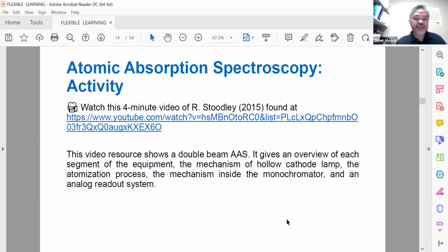Okay, so I would suggest that you find time to watch the videos. These videos usually discuss the double beam AAS, and give you an overview of the segments of the equipment, although we have some intro of this from the previous module: the mechanism inside, the monochromator, and an analog readout.